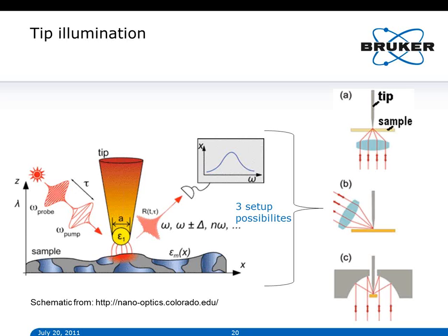So what I want to spend the rest of the time on is showing you what we can do when we use the AFM to enhance the optical signal. The generalized setup here, which I took from Markus Raschke's website at the University of Colorado, is shown on the left side.